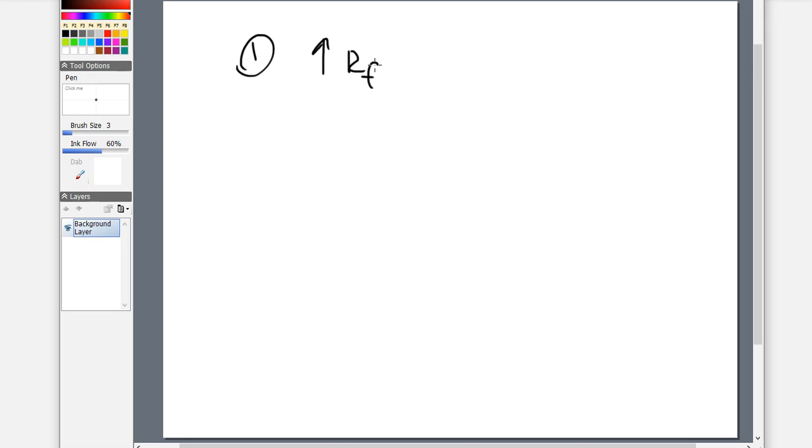And there is a chance that the plate is going to soak that mobile phase up faster because it is dry. It has not been preconditioned. It's not been placed inside of the tank. There's no gas phase present, or if so, very minimal. So all of the silica is going to be completely dry.